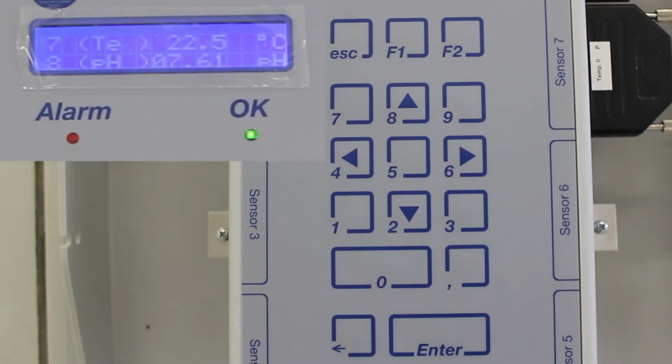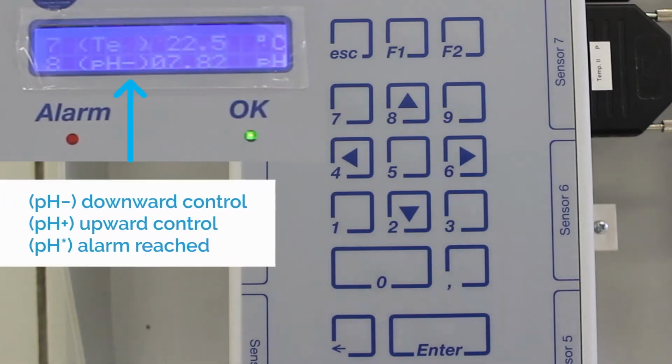Depending on the interval time you've set, it will show next all the modules you have connected, 2 at a time. A minus symbol inside the parenthesis means that a downward control is active. A plus symbol means an upward control is active. An asterisk means that an alarm has been reached.